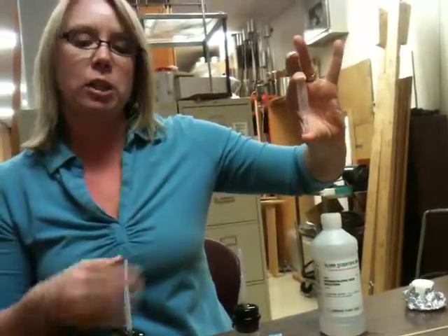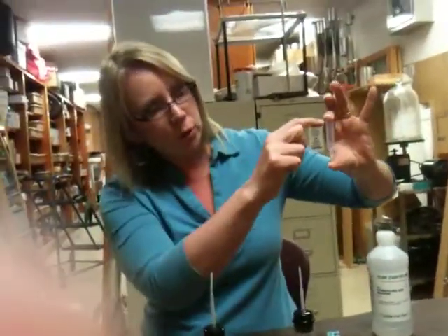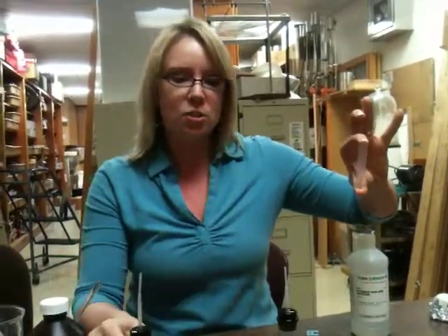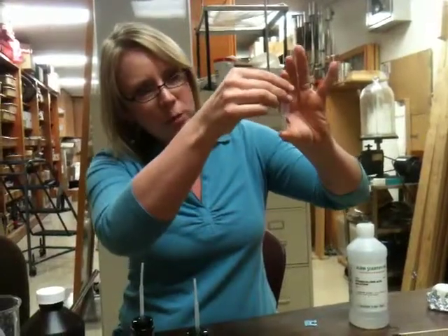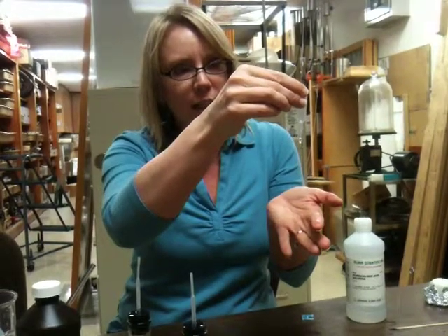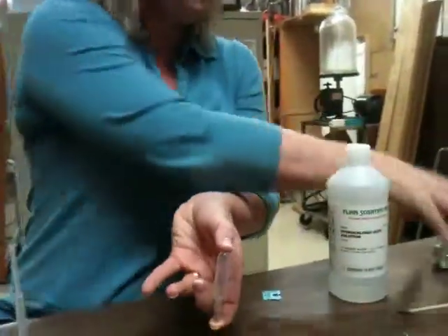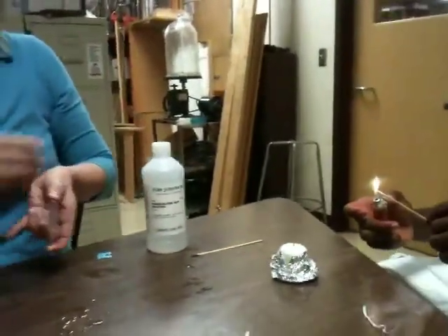If you had done a different ratio, let's say you wanted 1 part oxygen to 5 parts hydrogen, you would have only gone down a little bit with your oxygen, and then you would have gone down the rest of the way with your hydrogen. Now, we're going to test this just like we did before with the flame, the splint, but I've got a little bit of water in here, so I want to make sure that comes out before I test. Okay, so now it's completely empty, and we're going to light our candle. You could actually just keep your candle lit pretty much the whole time while this is going.